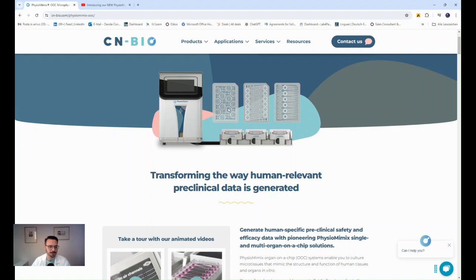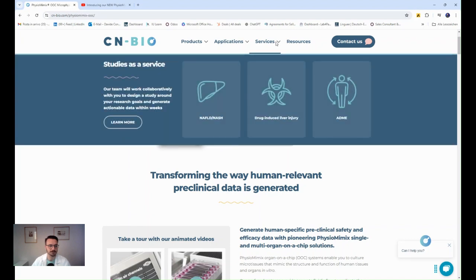You're basically limited to a maximum of 2 different organs per kind of experiment. So you have either 1 or 2, but for this they have a quite good biological relevance. They are really focused on liver, on ADME tox and this kind of work.